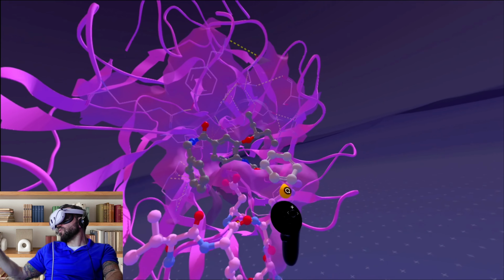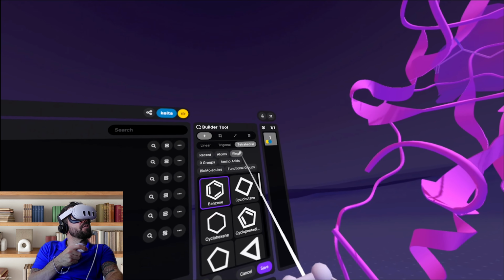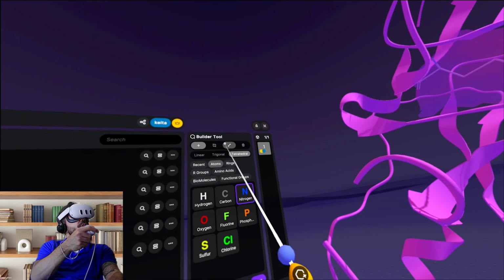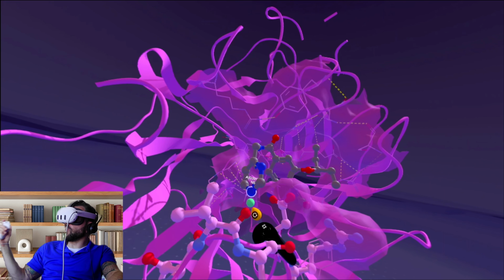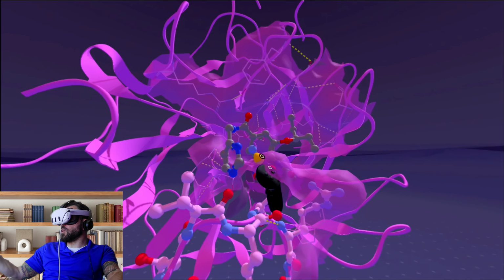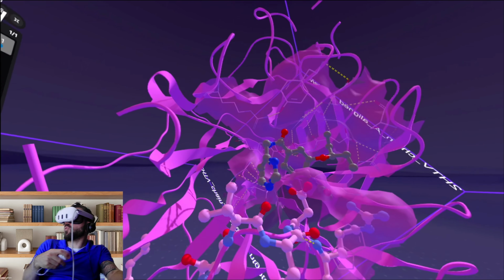So there we go. We've got a little carbon in there, and maybe we can replace some of these atoms. Maybe we want nitrogens. We can go to replace, see if maybe we pop a nitrogen here and here. These might be able to get us some hydrogen bonding interactions here. We can move our menu a little bit. Let's actually save this. We'll call that good.